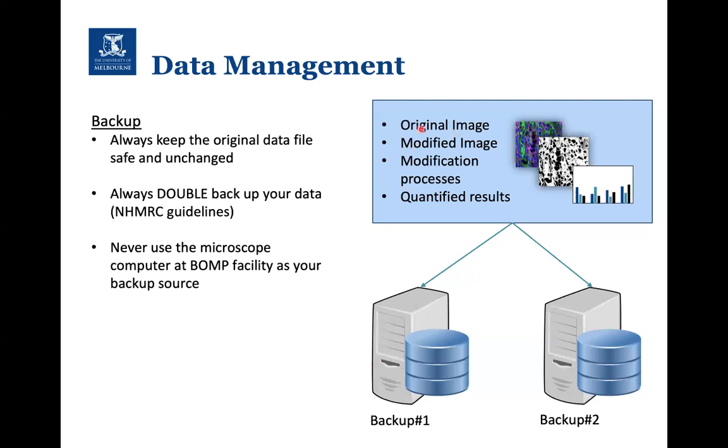Again, you need to be doing that for the original image, the modified image, any modification processes, and any quantified results. So it all counts as your data.